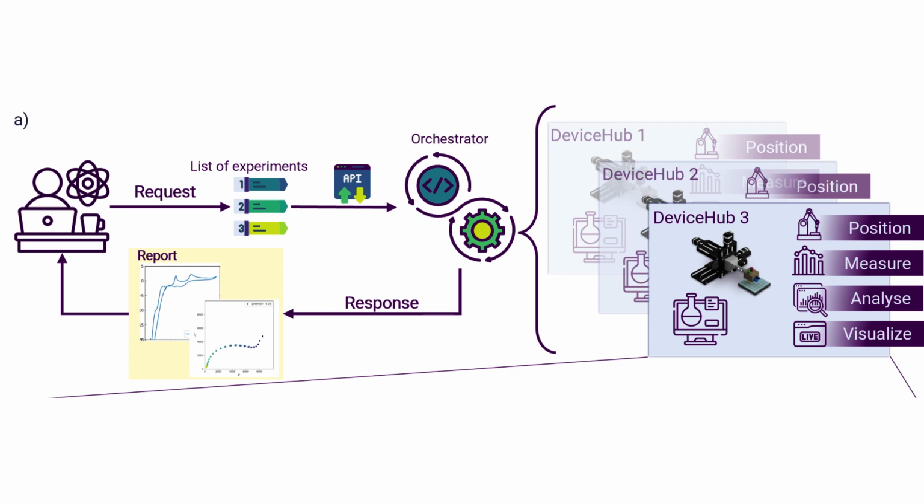Welcome to today's tutorial. In this session, I will introduce Auto-MISCHBARES, an abbreviation for our millimeter-scale high-throughput battery research system. This platform facilitates fully autonomous electrochemical measurements and represents an extension of our initial platform, HELAO. For those interested, I have provided a link to our paper for further reading.